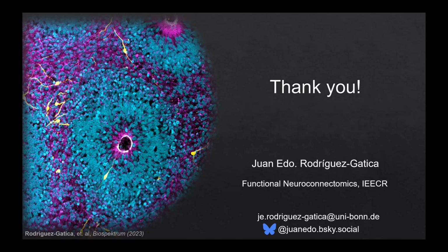Before leaving, I know that we are running out of time, I would like to confirm with you that the analysis and 3D you do is with Imaris software? Yeah. Imaris or ImageJ, actually. One advantage of the images that I show you is that most of them are without any deconvolution.